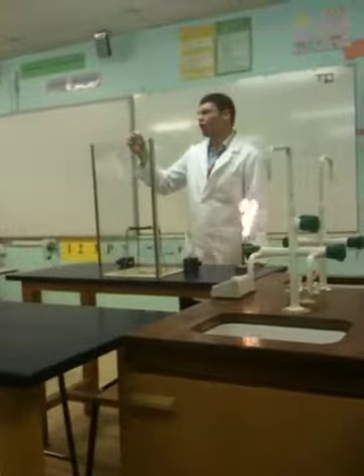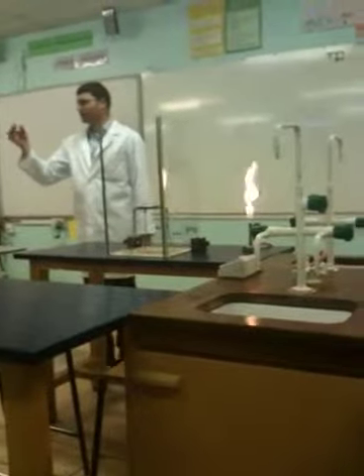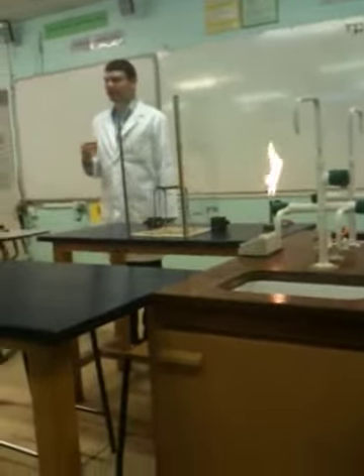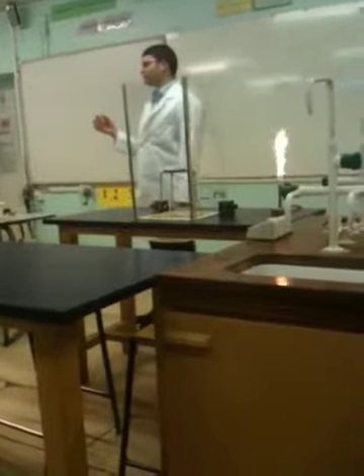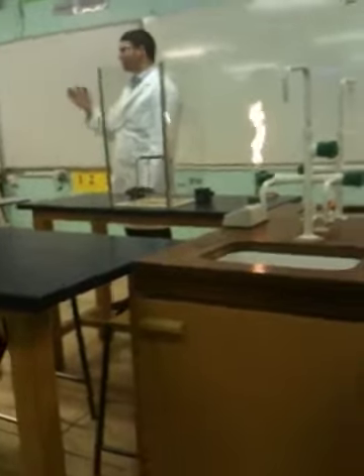We've got a mixture of copper oxide and magnesium powder. Because magnesium is a very reactive metal, it will react with the copper oxide and it will remove the oxygen from the copper and attach itself to it. It's called a displacement reaction — it displaces the oxygen.